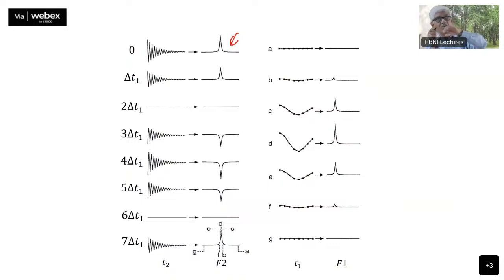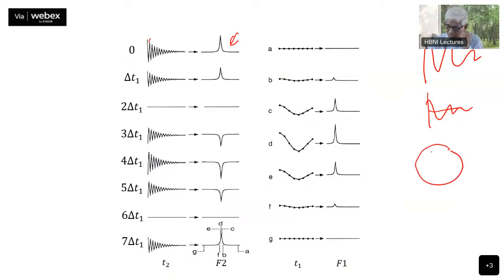The second one, the magnetization. Assuming that you have created a certain evolution of the magnetization, your FID does not start from the maximum, but starts with a slightly lower value. So your FID is starting, in the first case, like this. In the second case, it is starting somewhere like this. It is a lower value because the magnetization has evolved during this time period. And during the time period, the component which you are actually measuring along the y-axis, let us say, the y component, might have reduced. I will show you here a schematic.